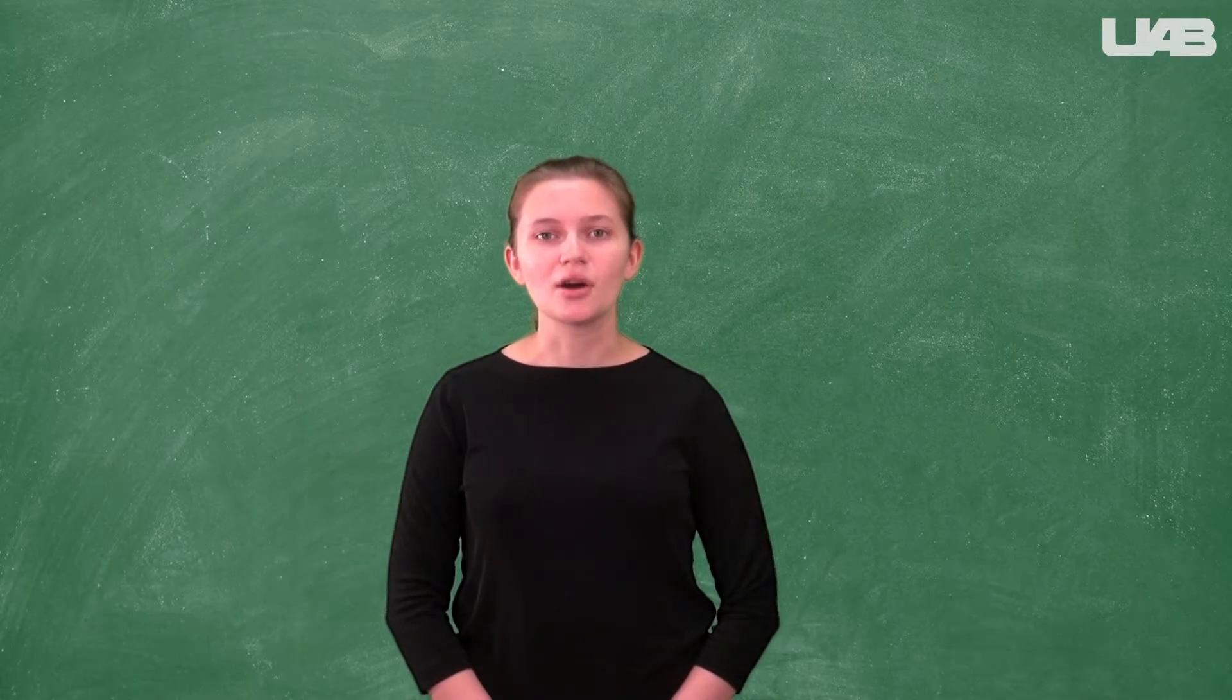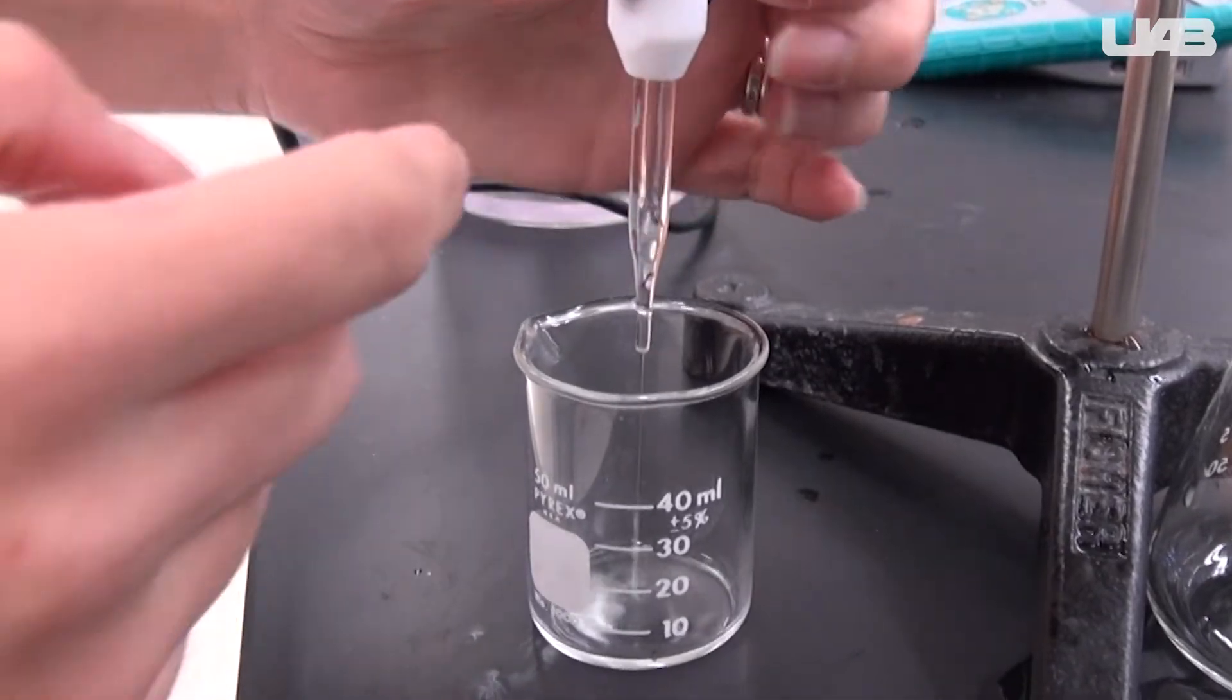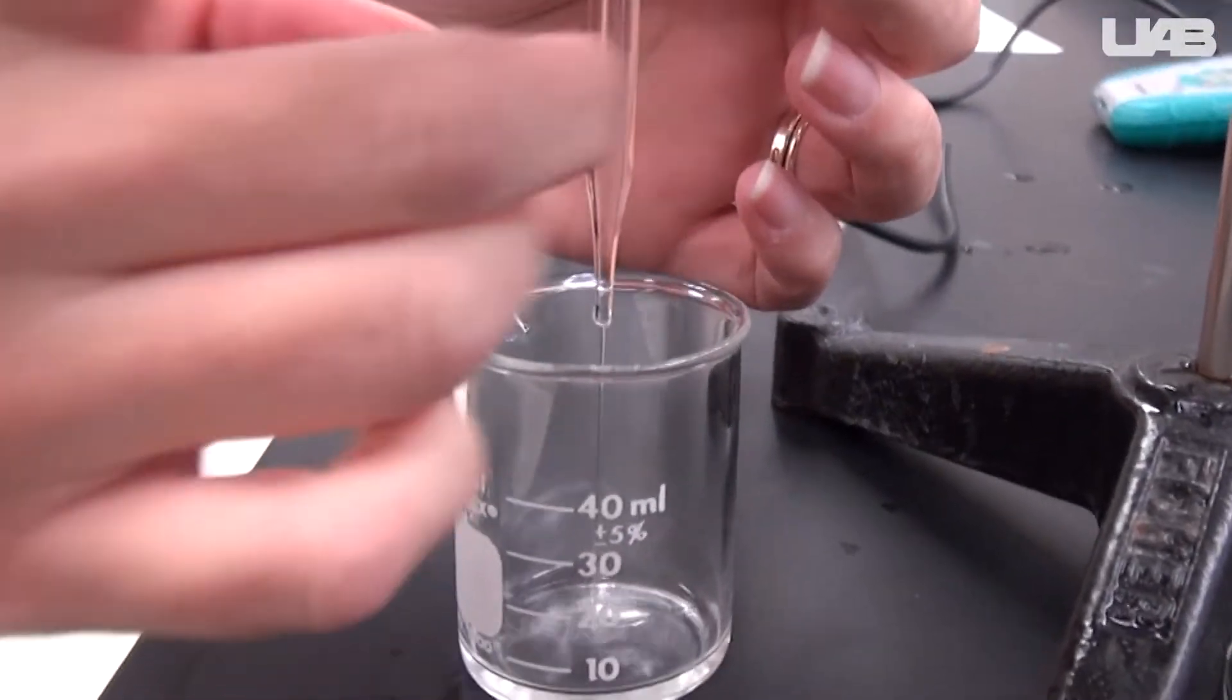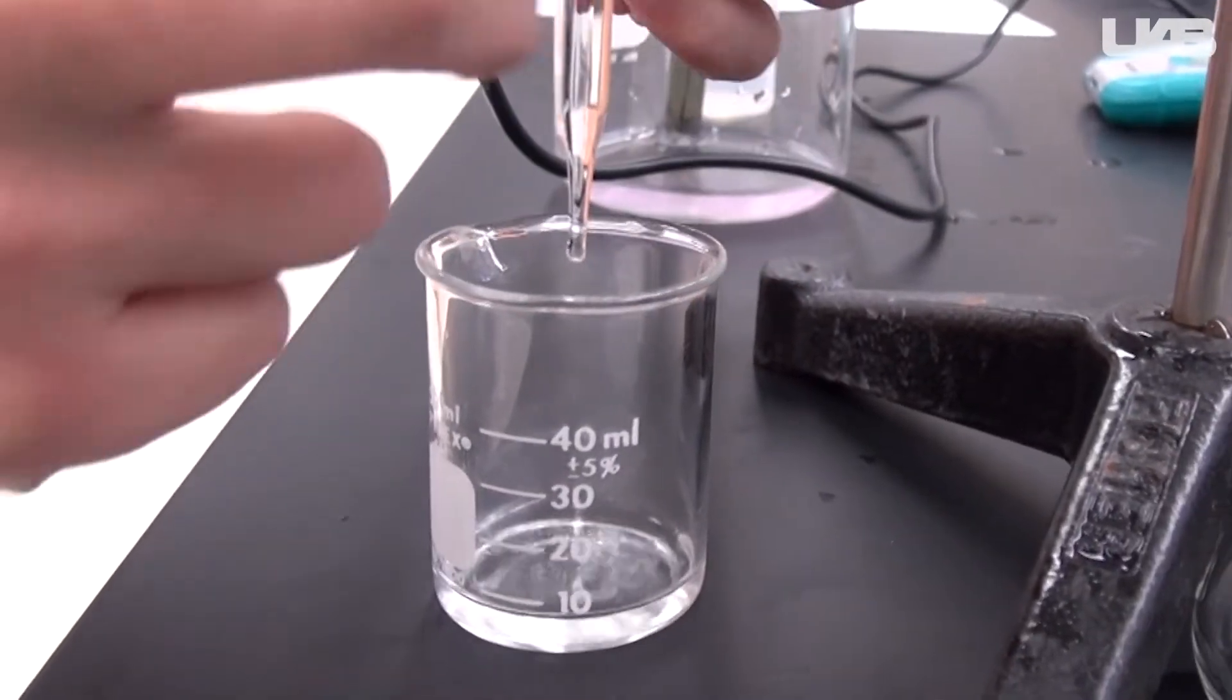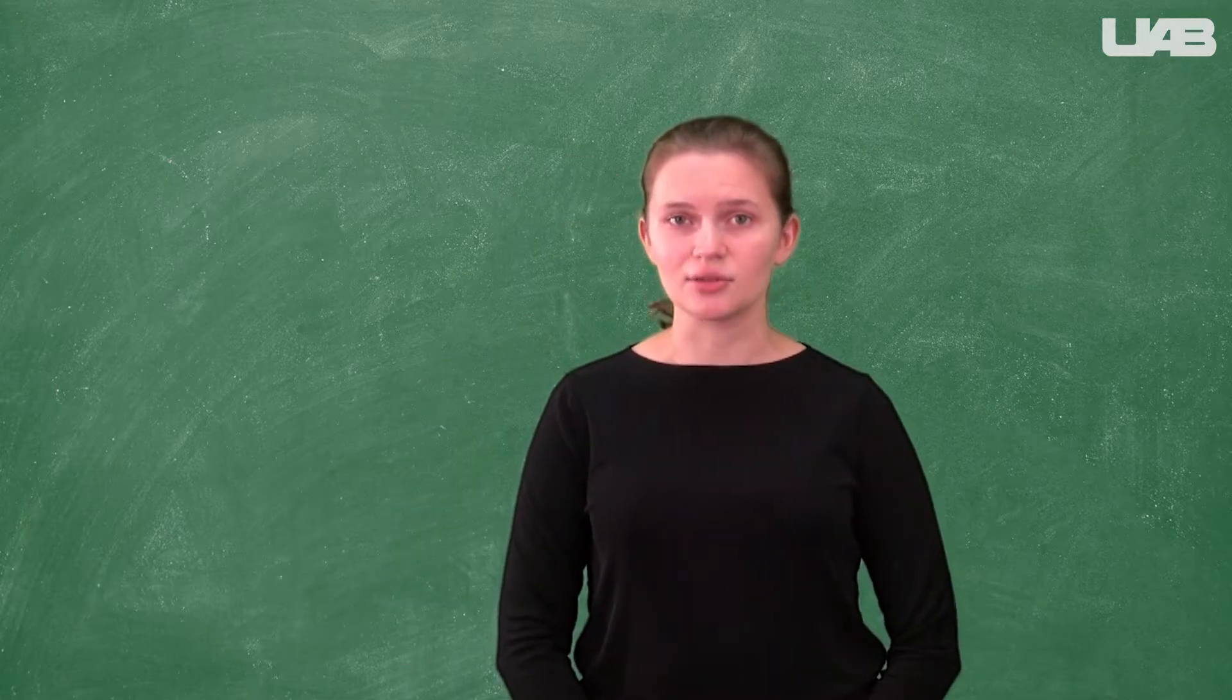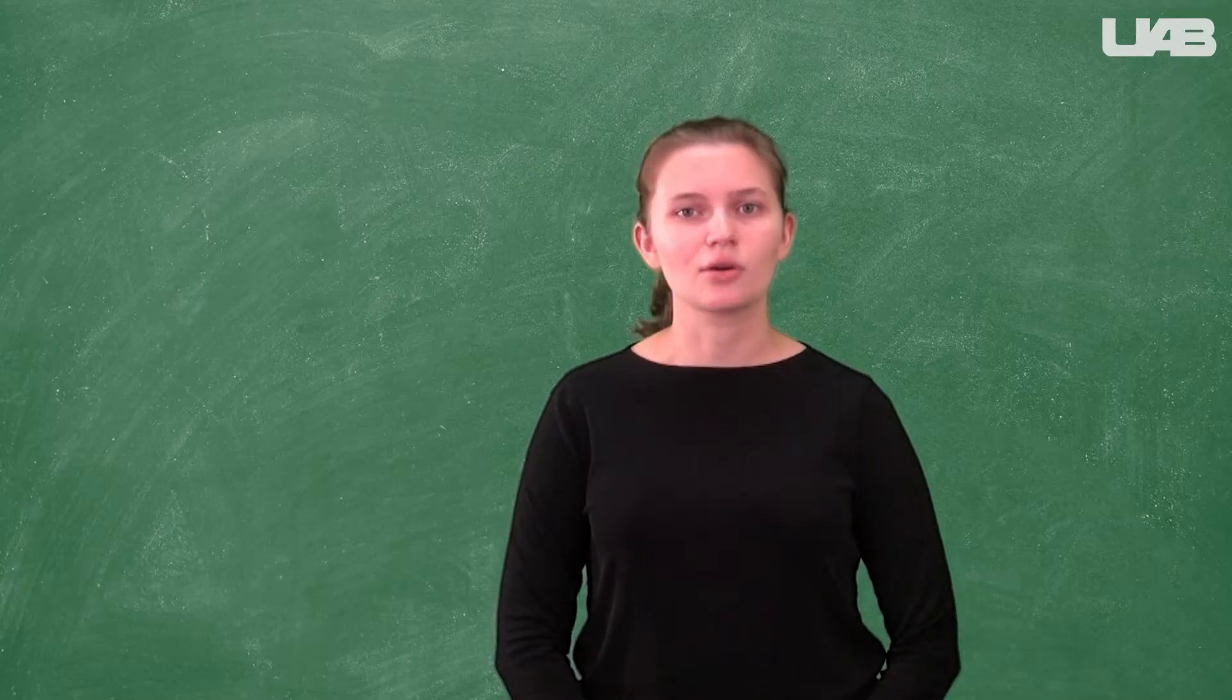Make sure that there are no air bubbles in the tip. To remove bubbles, get a waste beaker and place it under the burette. Turn the stopcock to the vertical position to allow the solution to drain, and gently tap or flick the tip to allow the bubbles to rise out of the top. Turn the stopcock back to the horizontal position. Make sure that the O-ring is not loose. This can cause the burette to drip even when the stopcock is in the horizontal position.